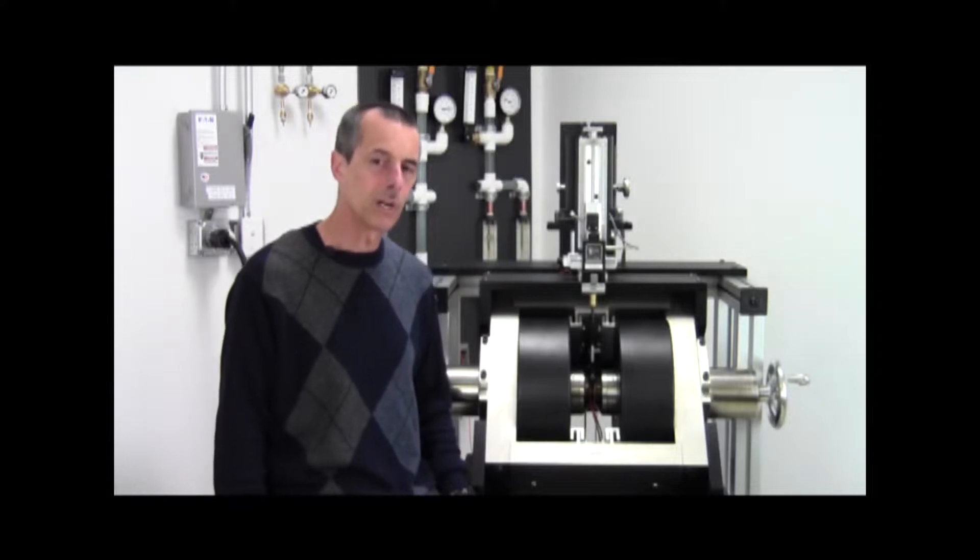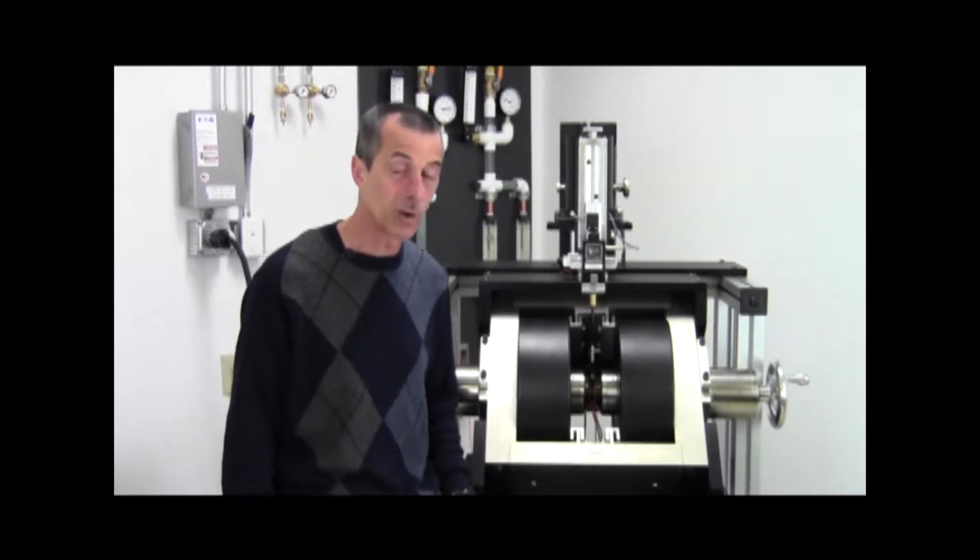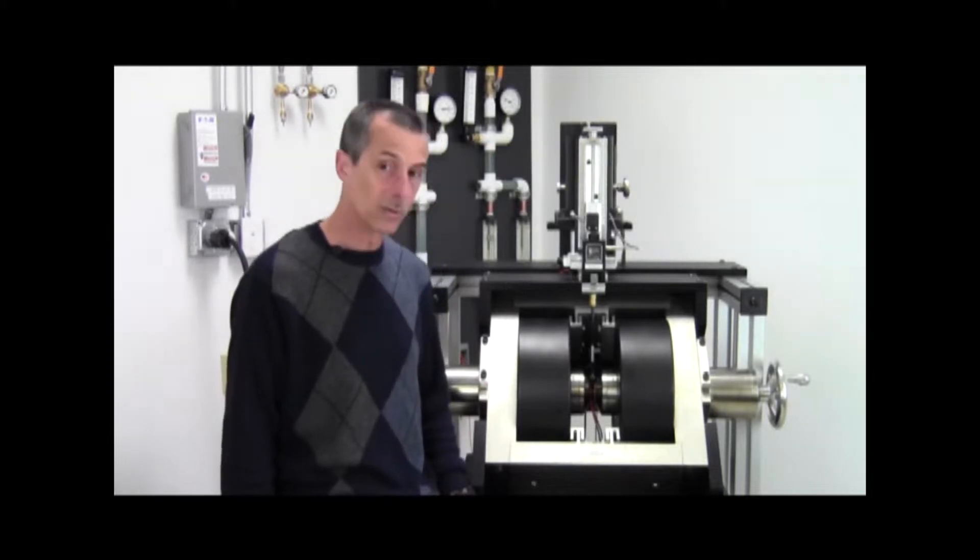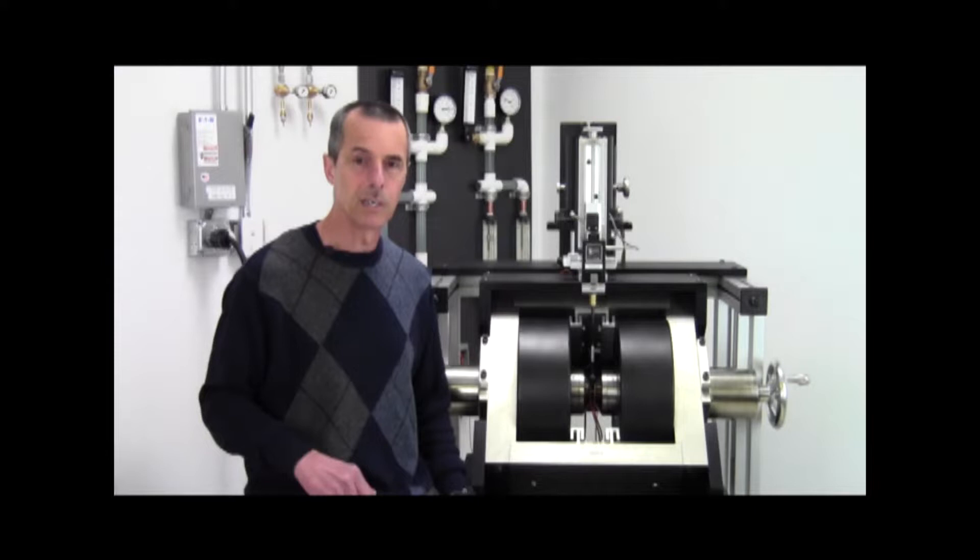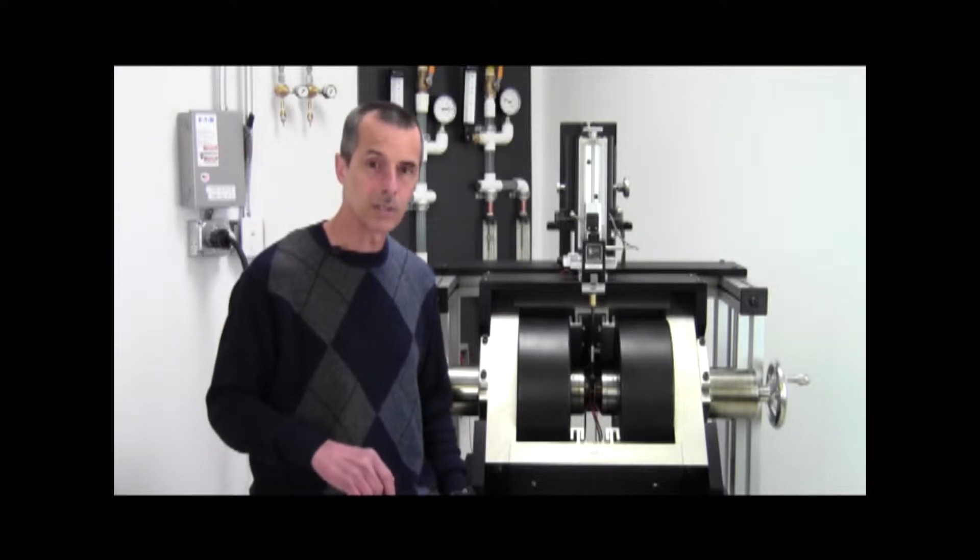you know that we've recently acquired the Micromag Magnetometer product line from Princeton Measurements Corporation, and I'd like to talk a little bit about that today. The Micromag Magnetometer product line includes both a Vibrating Sample Magnetometer or VSM and an Alternating Gradient Magnetometer or AGM.